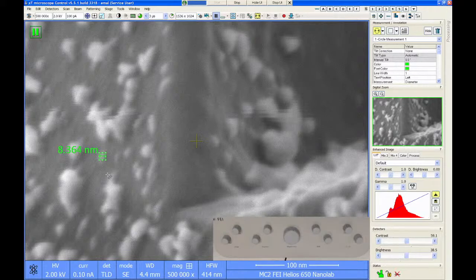Just because I don't think you're going to be very happy with the precision of measurements from this type of image. Now, if I'm just trying to show someone that a feature sits there on that surface, I would think this would be fine. But just kind of keep that in mind. You want a lot more resolution to get measurements than just observing something.